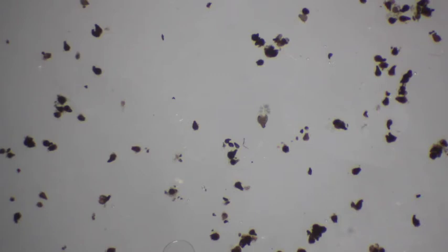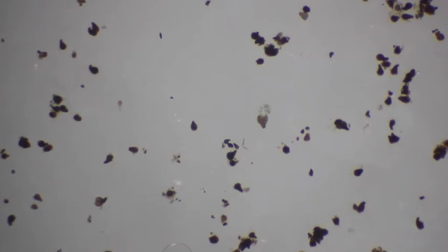And then I basically push down on the cover slip to launch out the spores. So right in the center I have one that's really good. We're going to zoom in on that one underneath this dissecting scope. I'm going to go all the way in and I'm going to focus, because as you zoom you actually have to change the focus. And there we go, that's really nice.